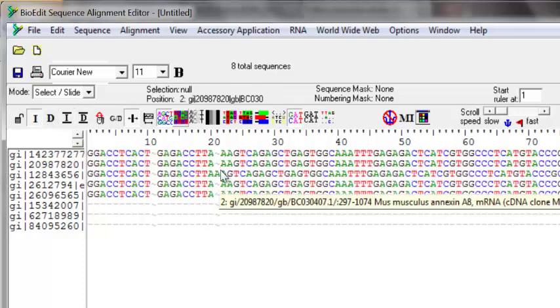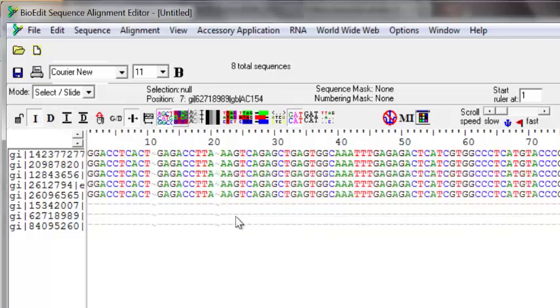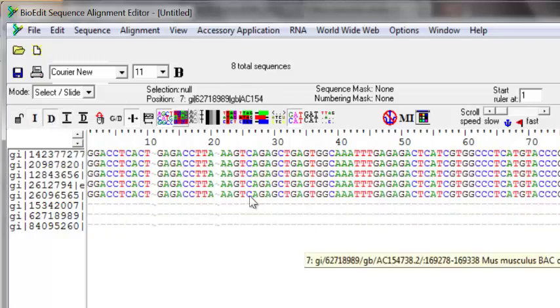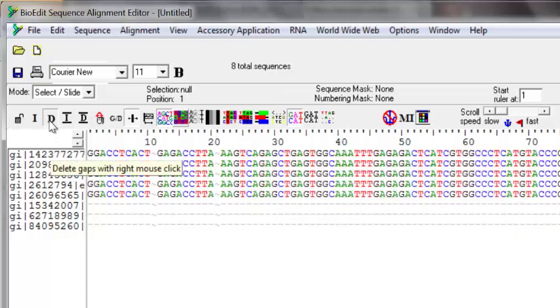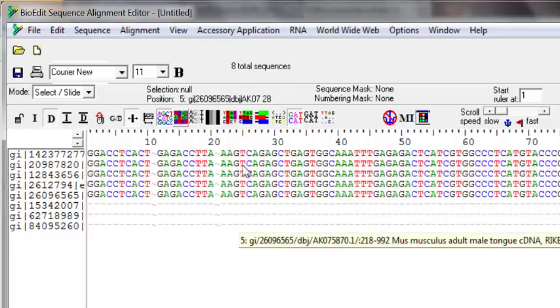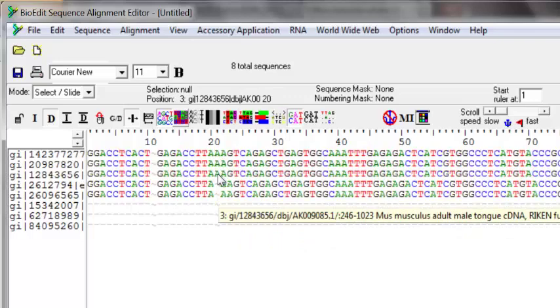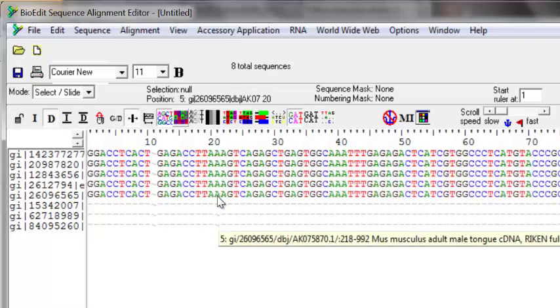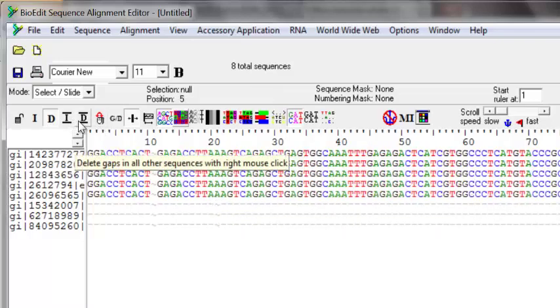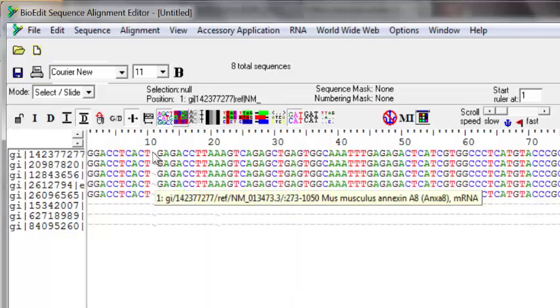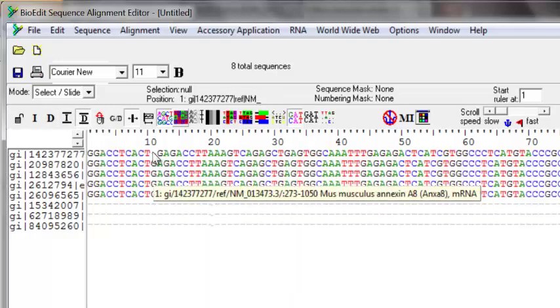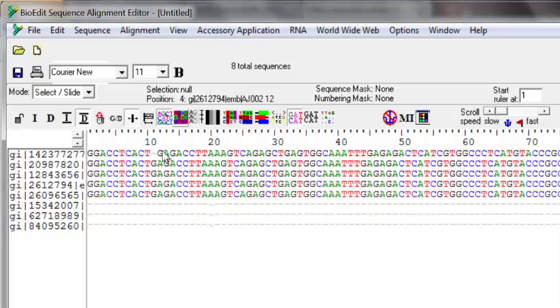You can delete gaps the same way. If by mistake you added extra gaps, or there is a gap which should not be there, you can press the 'delete gaps' button and right-click on the sequence to delete the gap at that position. You can also use 'delete gaps in all other sequences' — clicking a sequence will delete the gaps in all sequences other than the one you clicked.